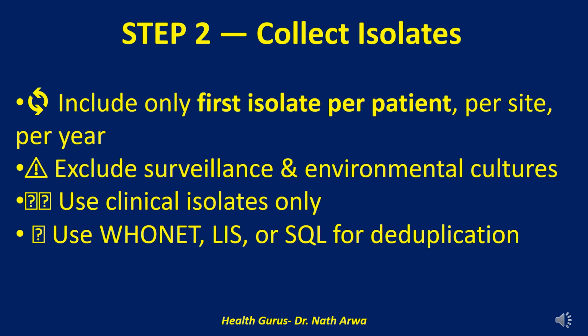How do you pull and clean this data efficiently? Use tools like WHONET, your laboratory information system, abbreviated as LIS, or even custom SQL queries. These platforms can help you automate deduplication, organize isolates, and apply filters, so you're working with clean, accurate, and non-redundant data. So in step 2, you're not just collecting data, you're curating it.